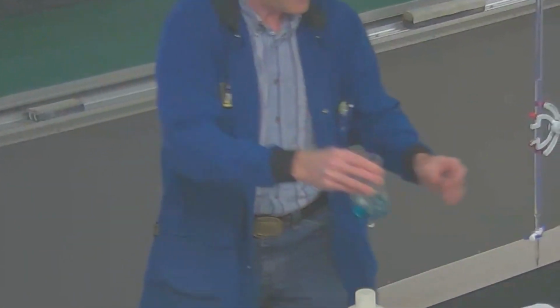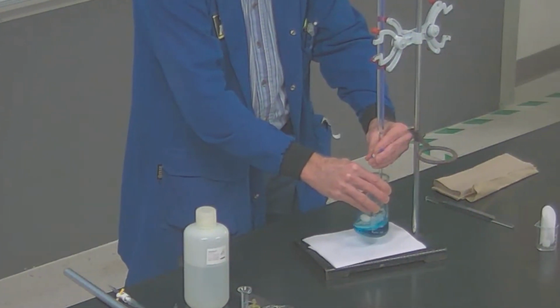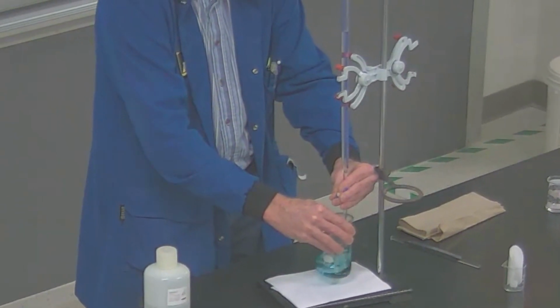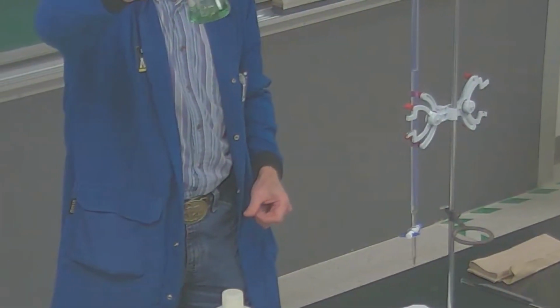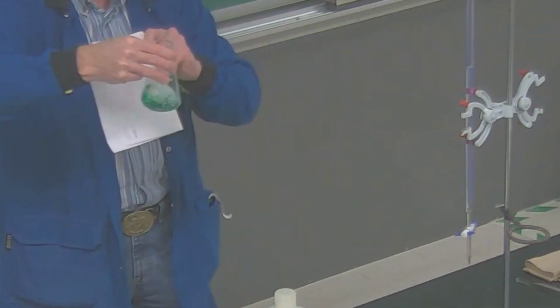I thought I had it. Just went back to blue. That ethylenediamine to nickel is a whole number ratio, so if you are off a little bit, if you slightly over titrate and make it yellow instead of stopping at the green, it's not going to be an issue. You've got that green color there. This is what the endpoint should look like. I meant to wear a white lab coat so you can see that a little better.